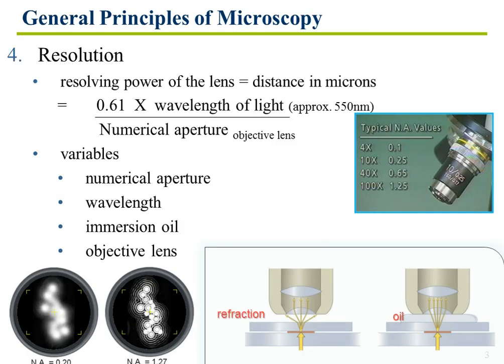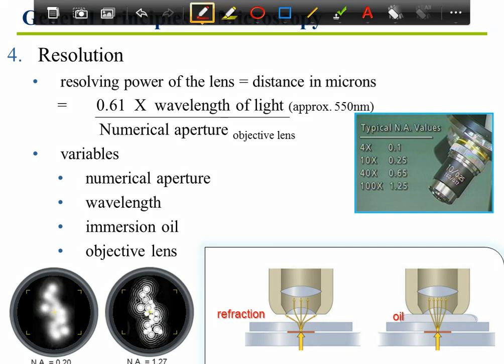All right. So, look at the picture down here at the bottom. Let's start there. It doesn't even matter what the magnification is or what we're even looking at, but look on the left over here and you'll see some blurry objects. They're very close together. Some of them you can see individually, like this one looks very different from that one. You can see it's different from that one. But down in here, you can't really tell what you're looking at, if it's one object or 4 or 5 or whatever. Well, look at the picture over on the right, and you see much more detailed.